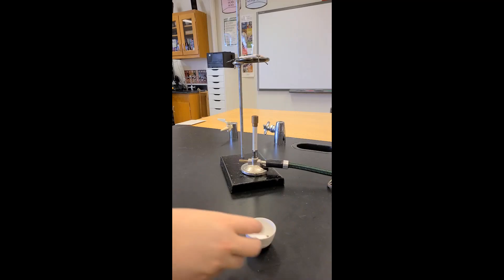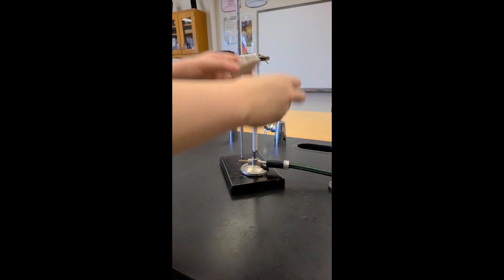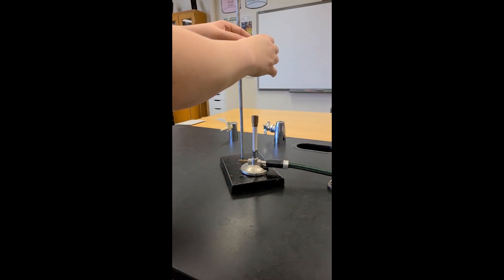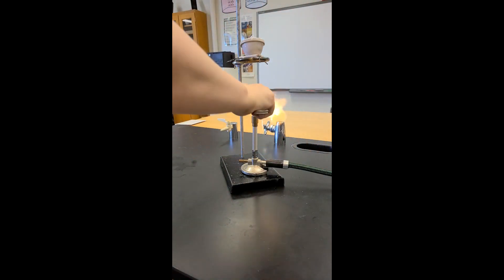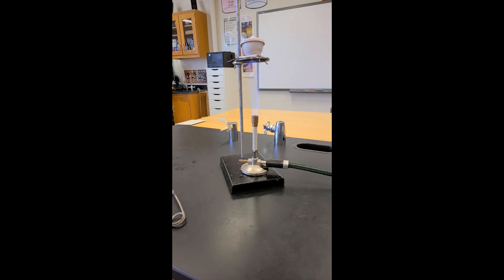Our next step is going to be to heat the sample strongly. Using a Bunsen burner, the gas is turned on and a striker is used to ignite the flame. The flame is adjusted so that we see that nice lean blue flame. If we see an orange flame, that indicates that we're having some partial combustion, and that can actually cause soot, which will impact our mass measurements.